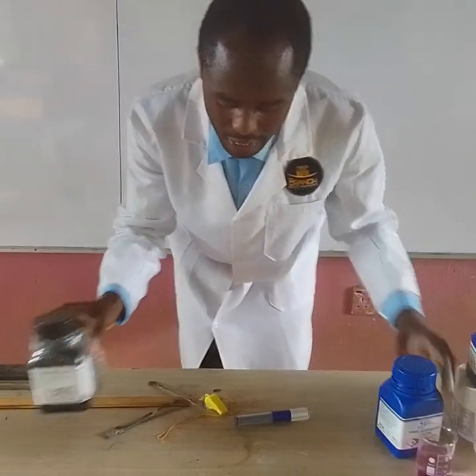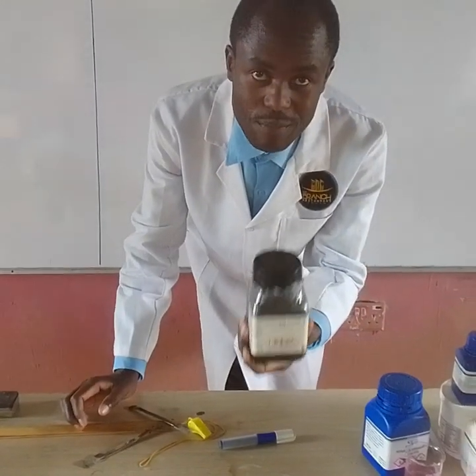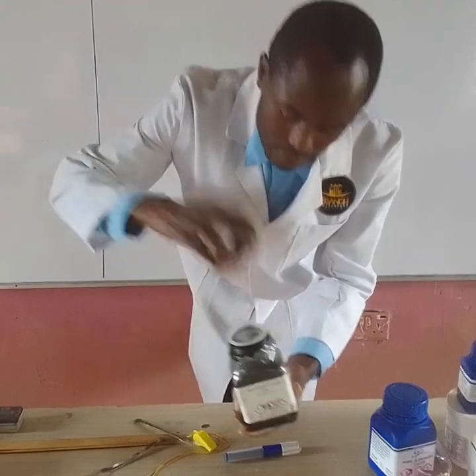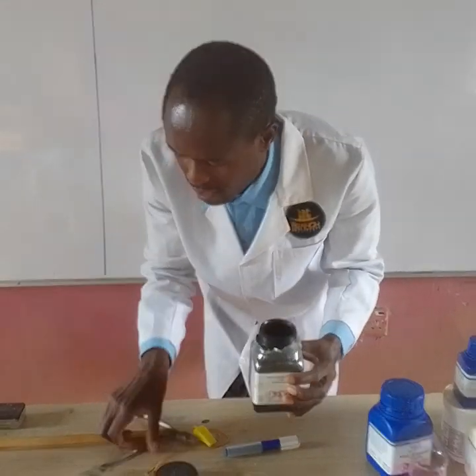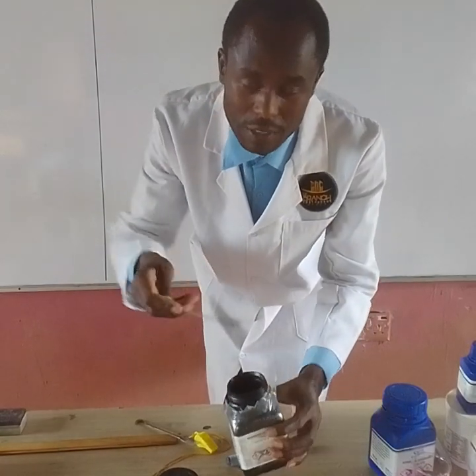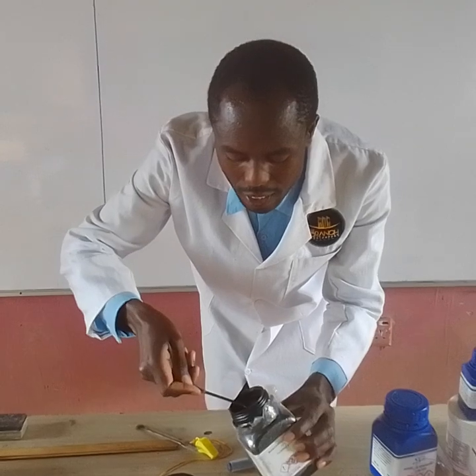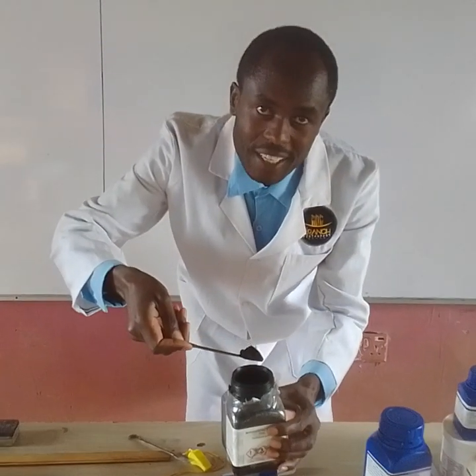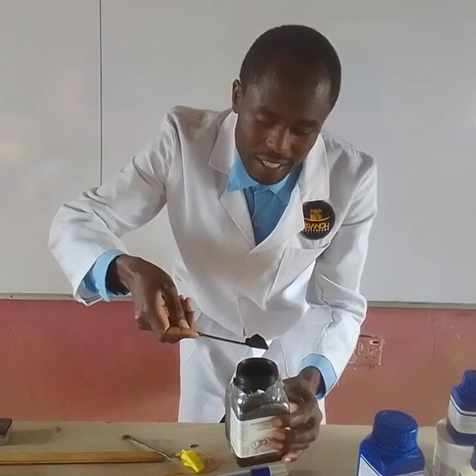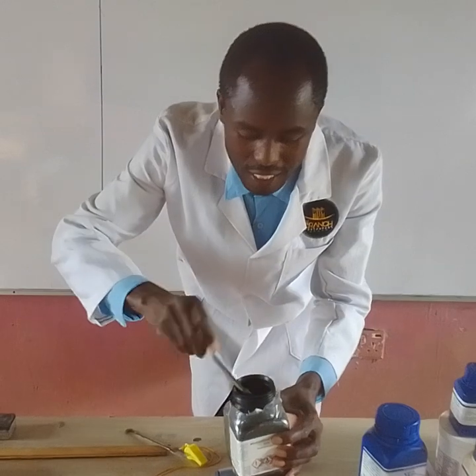Let me put it aside. The next solid is manganese(IV) oxide. So my students, I take another clean spatula and scoop the solid like this. Manganese(IV) oxide solid. Look at the color. The color is black. So it's a black solid, manganese(IV) oxide. Is it okay? You can check and see.